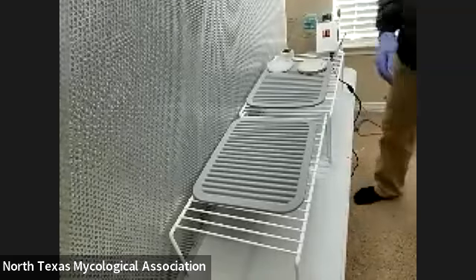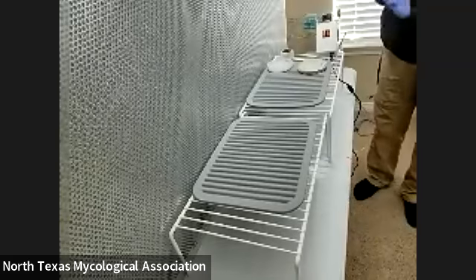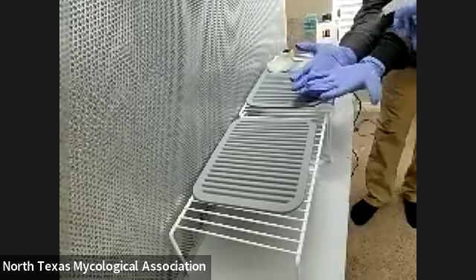So let's spray the alcohol on our gloves. We're spraying alcohol here. Good idea.